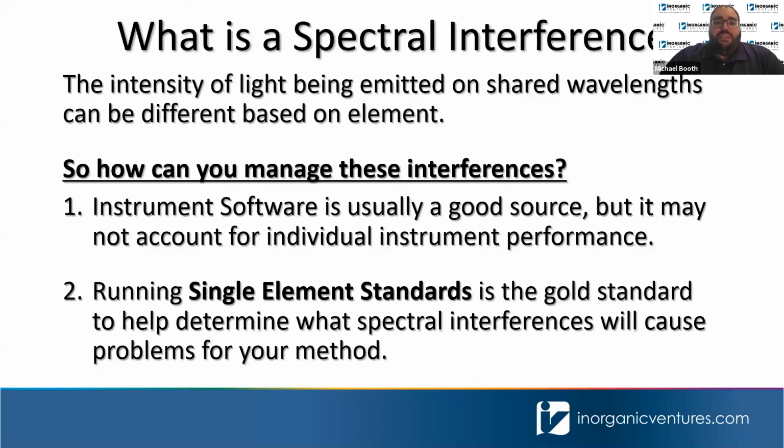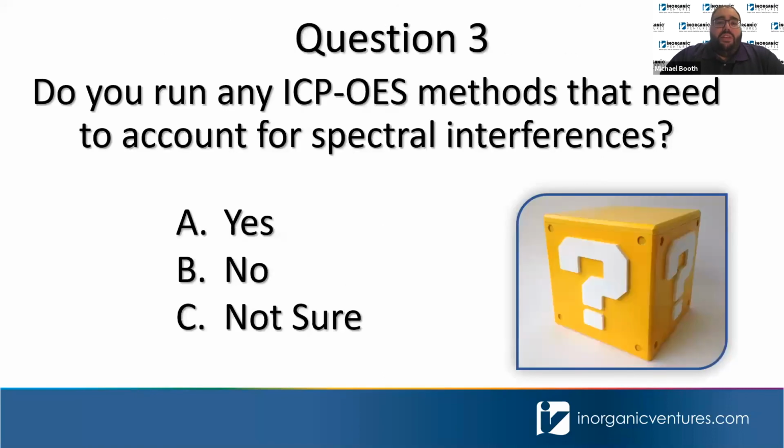So I think coming up next, we have another question for y'all. Do you run any ICP-OES methods that need to account for spectral interferences? And you may or may not know, it might already be built into your method and you're not even seeing it day to day.